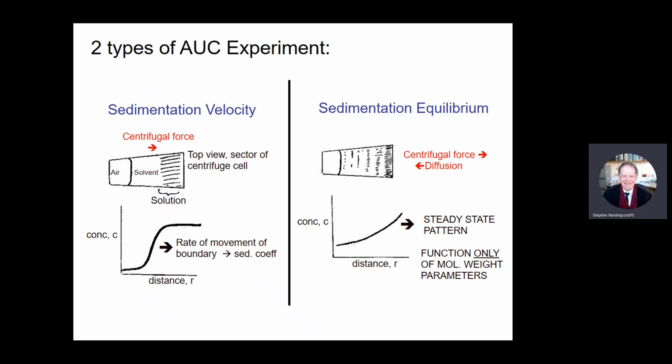And what happens here is, as this stuff is piled down to the bottom, an opposing force called diffusion tries to push it all back, because this is thermodynamically unfavorable, having all the ordered so that all the protein is down there and all the liquid is here, all the solvent is here.